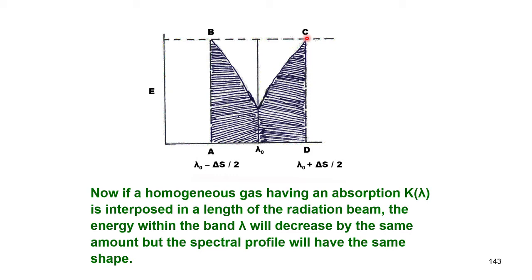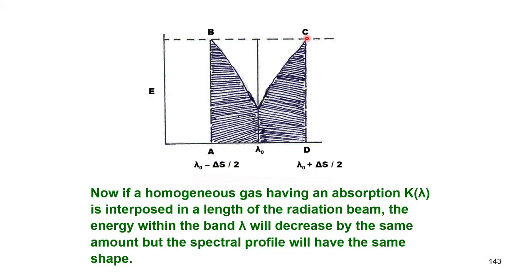This is a bit difficult to understand, but if you imagine a rectangle and put that figure in it, the amount of energy decrease is nothing but the integral of this, which you will understand very easily. Instead of considering the radiation per unit volume, because if I have to quantify, I must say per unit volume what is the amount of radiation decrease observed here. That is the idea of the whole quantitative analysis.